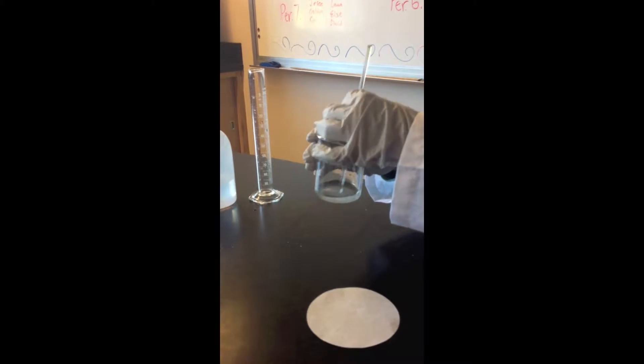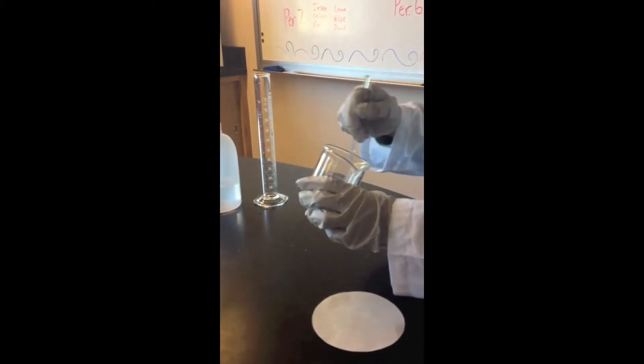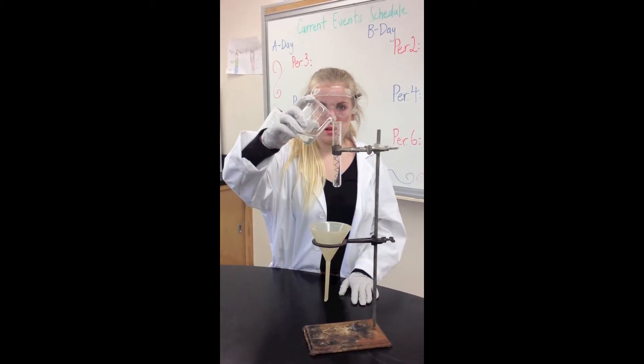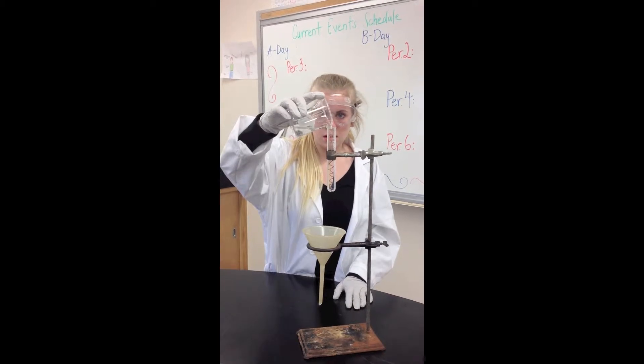Using the stirring rod, mix the water and Silver Nitrate until it's completely dissolved. Pour the Silver Nitrate solution into the test tube with the copper coil. Wait about 30 minutes until the reaction occurs.